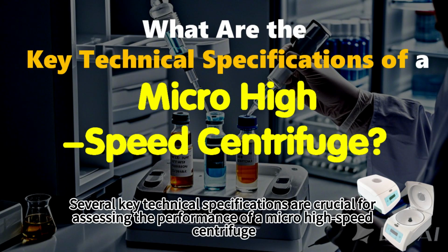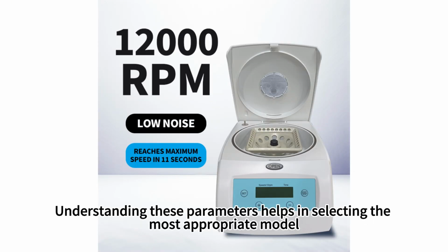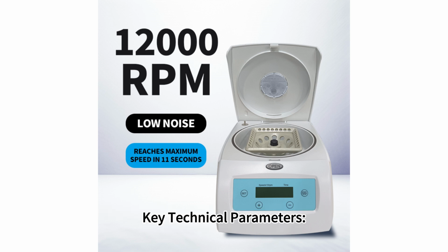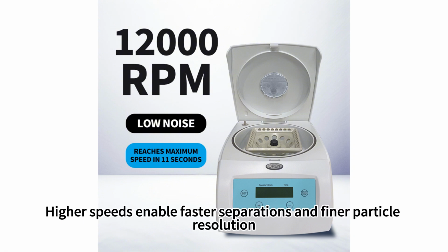Several key technical specifications are crucial for assessing the performance of a micro-high-speed centrifuge. Understanding these parameters helps in selecting the most appropriate model. Key technical parameters: maximum speed, RPM. Description: measures the highest rotational speed the centrifuge can achieve. Importance: higher speeds enable faster separations and finer particle resolution.